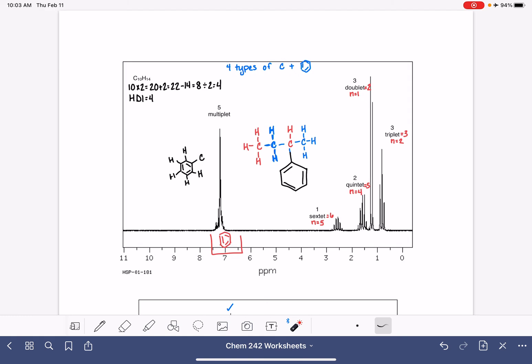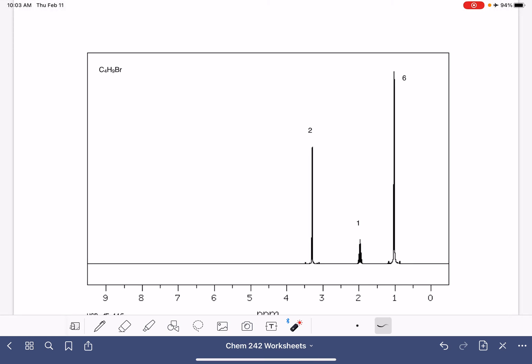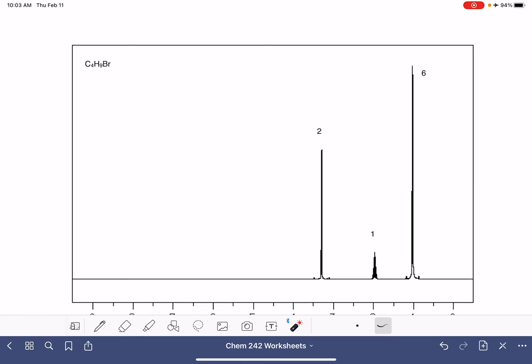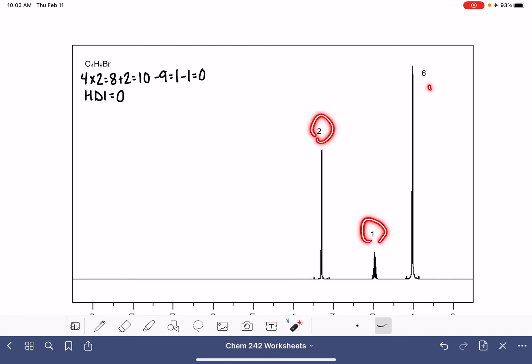We have one more set to go. We have C4H9Br. Let's analyze our HDI: 4 times 2 is 8, plus 2 is 10 maximum hydrogens. We have 9 hydrogens and one bromine, so we have an HDI of zero. Our integration is given to us: it's a 2, a 1, and a 6.